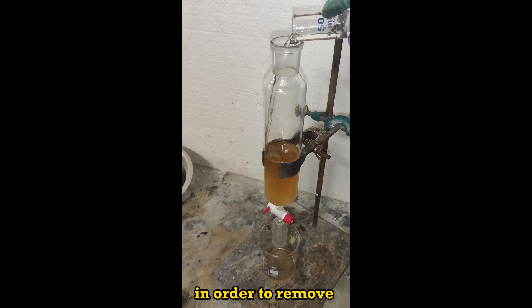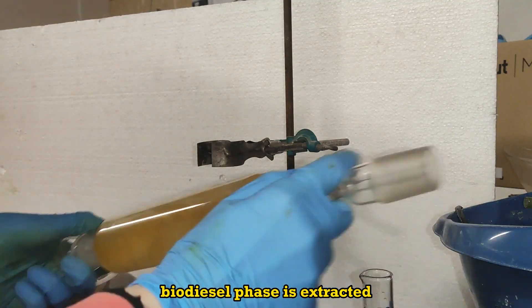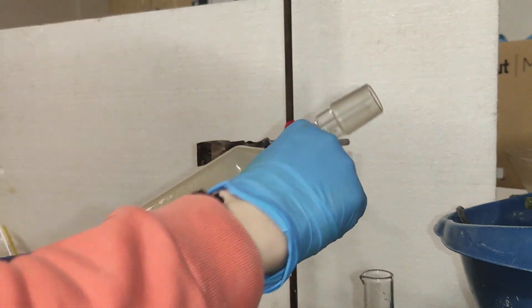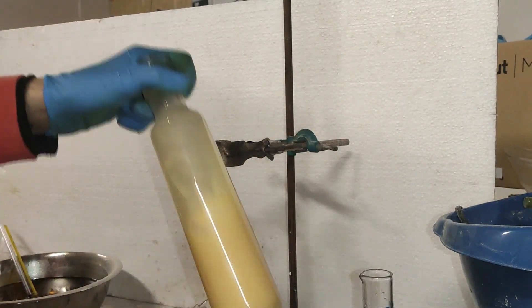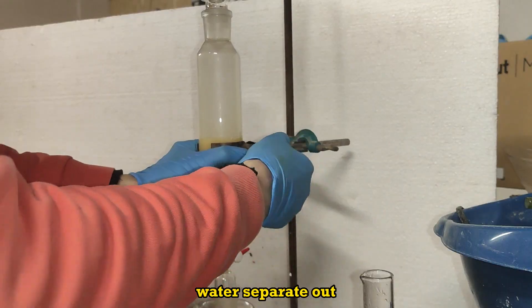In order to remove any water-soluble byproduct, the biodiesel phase is extracted with 50 milliliters of water. A strong emulsion is formed, from which slowly water separates out.